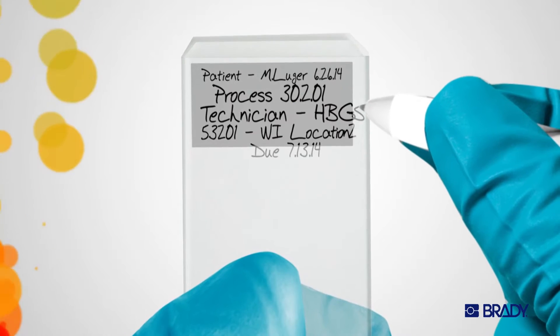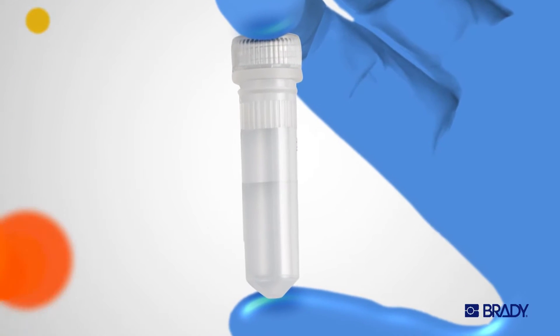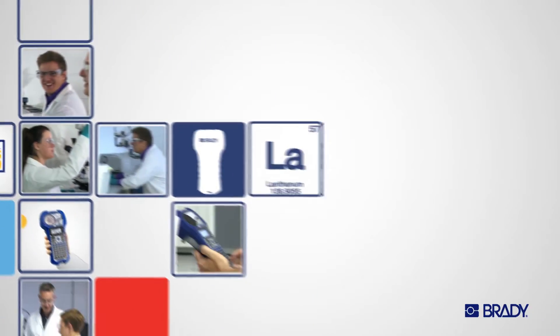Pens aren't perfect. You can't write everything you need, it's tough to read, and sometimes it just disappears. That shouldn't impact the integrity of your lab.